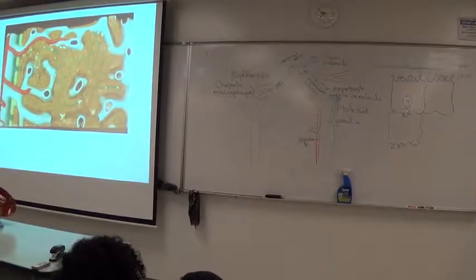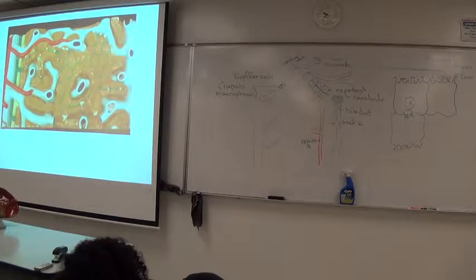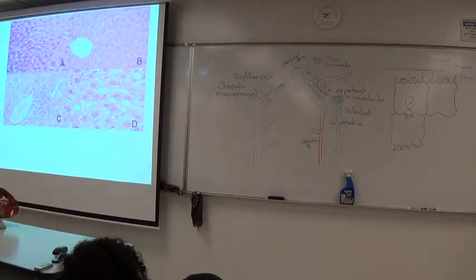Pardon? These? Right next to it. This? No, you were touching it. Where? That's... Oh. Well, that should be inside. I thought these were something, squamous epithelium on the outside. That's this one. Okay. All right. Well, it should be on the inside.